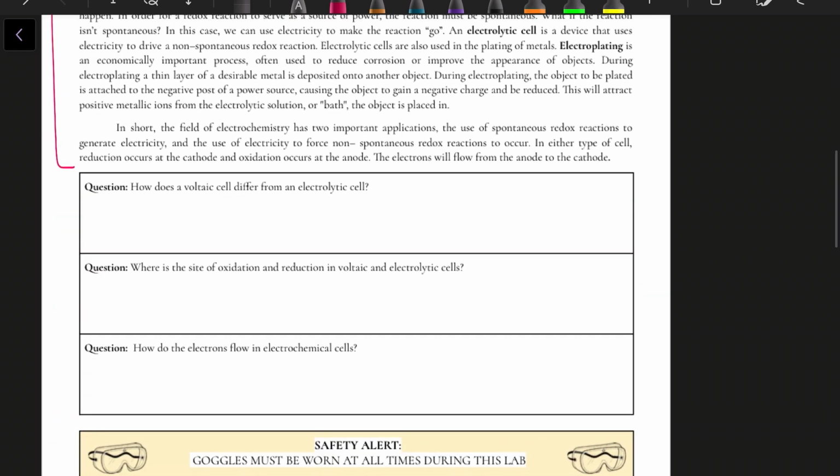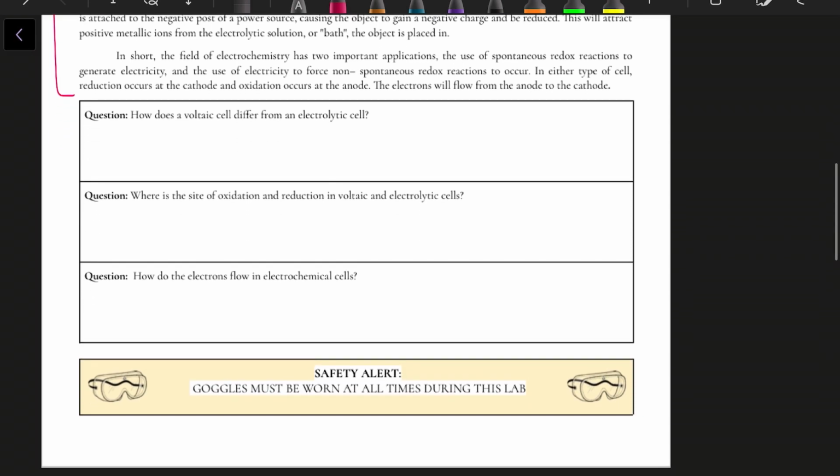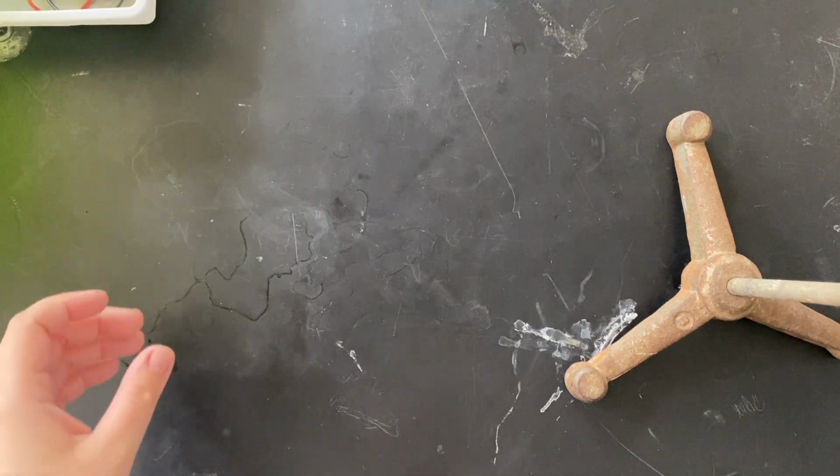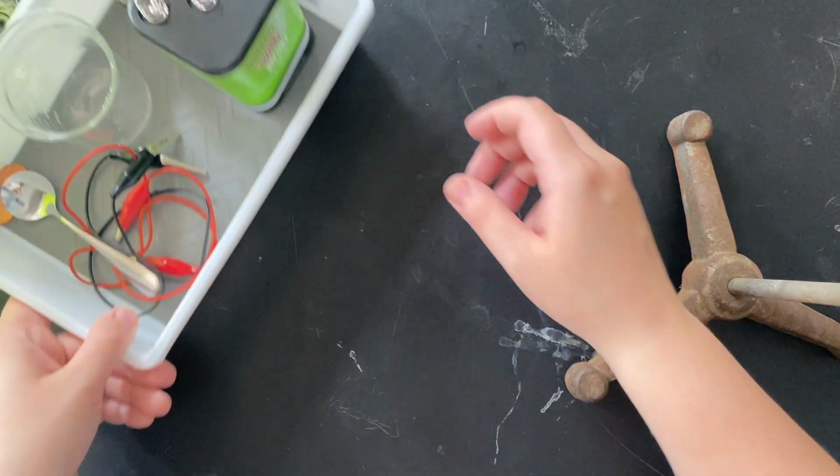So you have 3 questions before you even start the lab based on information from the background information and your knowledge of chemistry, essentially asking you the differences and similarities between electrolytic and voltaic cells. Once you finish that part and you are working on the lab, goggles must be on the entire time as we are working with chemicals. Okay, so once your lab goggles are on, it is time to start the lab.